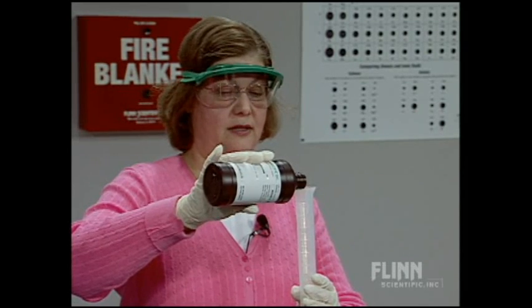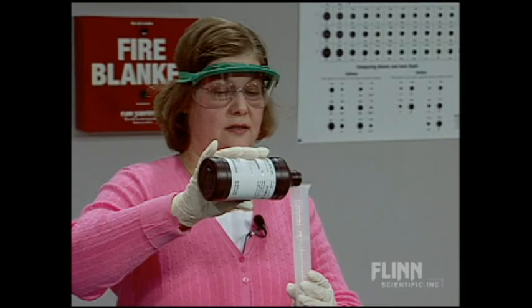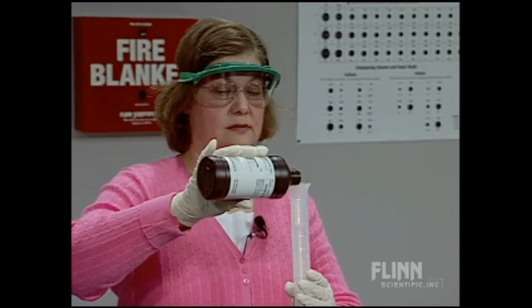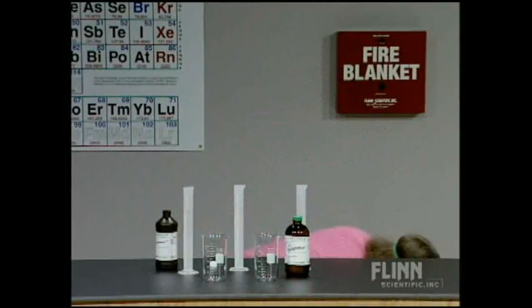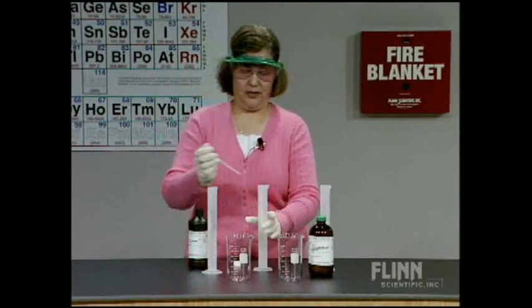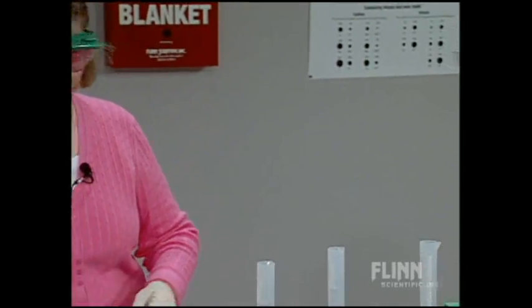Oh, we can hear that. I'm going to get a plastic pipette here and just top it off a little bit so that I have equal amounts. And again, I'm getting 80 milliliters. So I went ahead and measured the hydrogen peroxide.